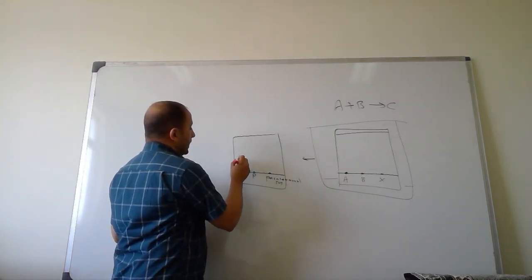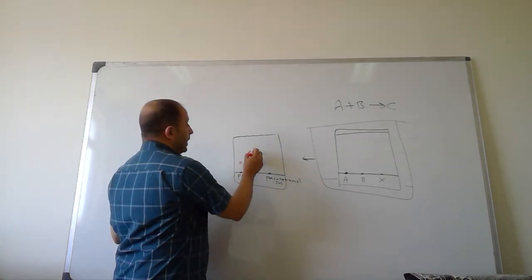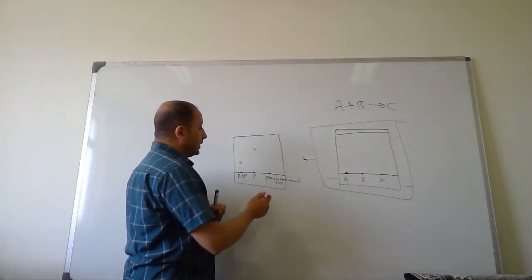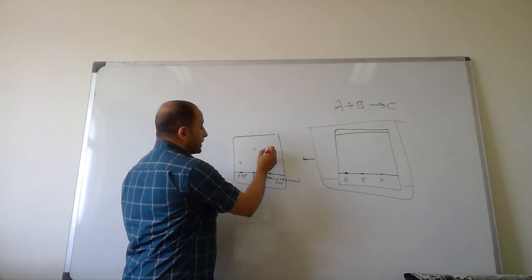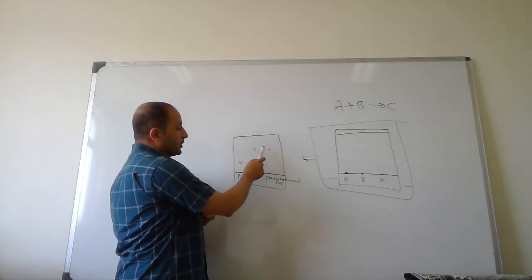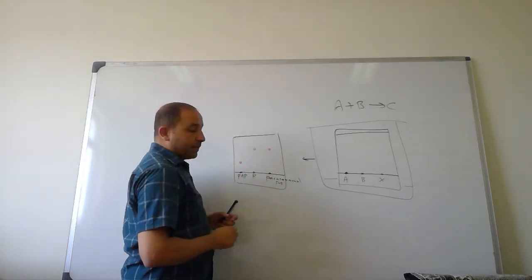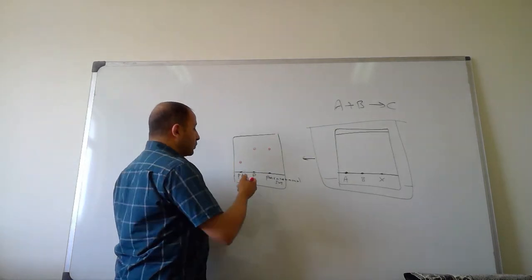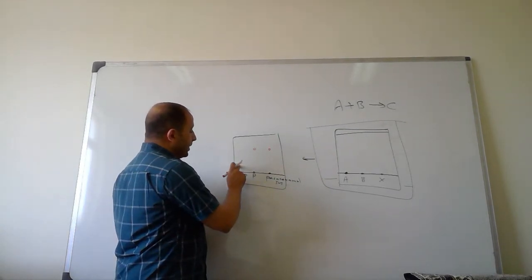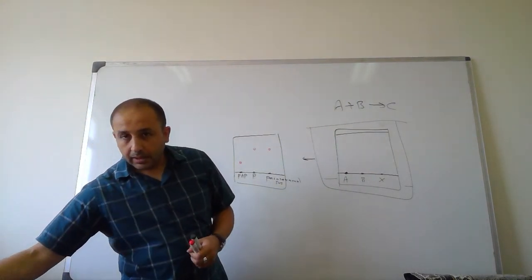Now, assuming that we have a spot here for para-aminophenol, and here for paracetamol we have a spot here, whereas paracetamol gives us just one spot. Now, this one spot is just parallel with paracetamol, so we have nothing from para-aminophenol. Sometimes we have para-aminophenol, but in a concentration less than the limit test.